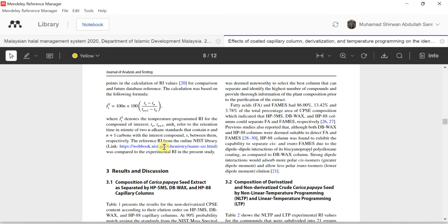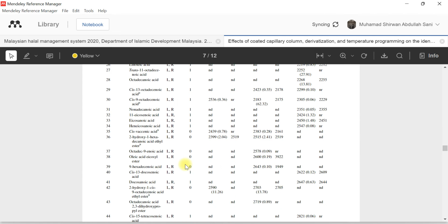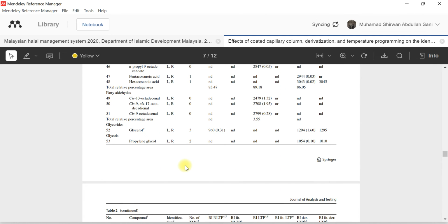Clearance cycle. Pakai Excel lah. Masuk je formula ni, tarik je. Dapatlah. Nampak macam wow kan? Tak, tak, tak. Untuk orang yang analytical chemist, dia akan macam biasa je. Orang lain mungkin nampak macam wow. Bagi saya, tak. Tarik je dalam Excel tu. Tapi saya buatlah formula ni. Dalam Excel tu kita tarik saja lah. Ya. So yang ni cara saya nak, kita panggil apa? Memeriahkan result tu lah sebenarnya.